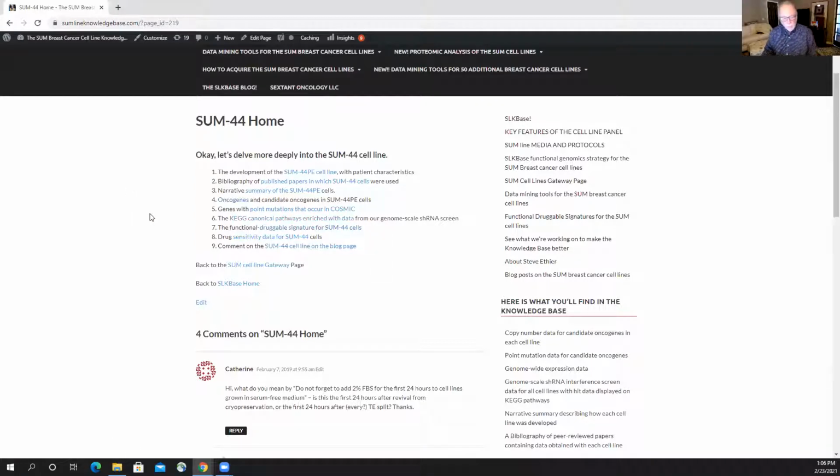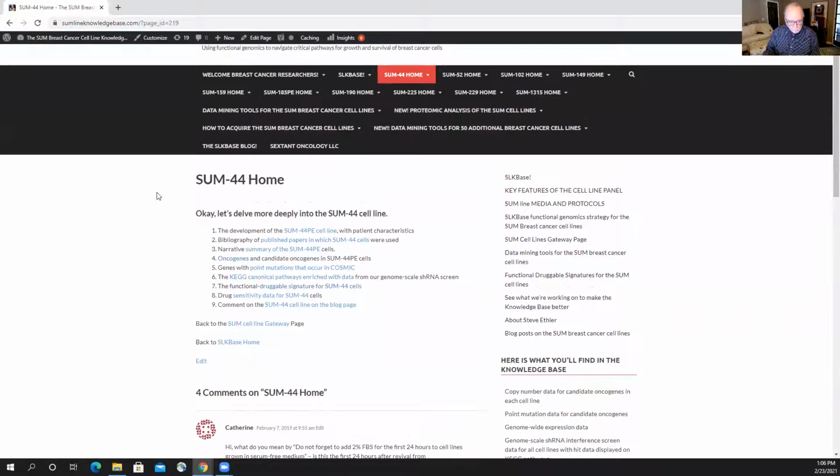So at some point as we go through these videos, we're going to get in depth on all of these, but all I want you to see at this point is that for all of these pages that are relevant to the Sum44 breast cancer cell line, there's basically two ways to get to them.